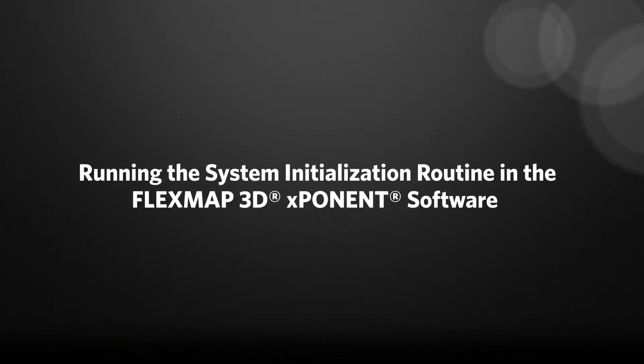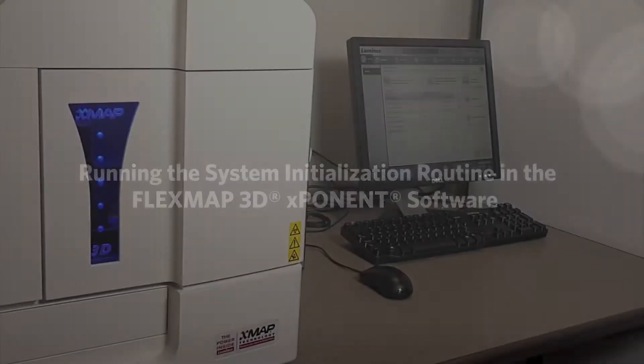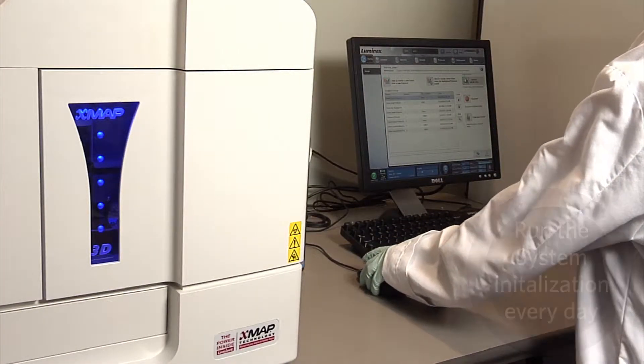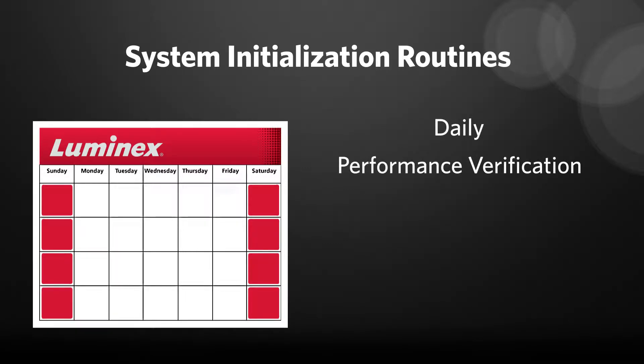How do I initialize the FlexMap 3D? The first task you will perform before using your system for the day is system initialization. Luminex recommends that your system initialization routine settings include daily performance verification and weekly calibration.